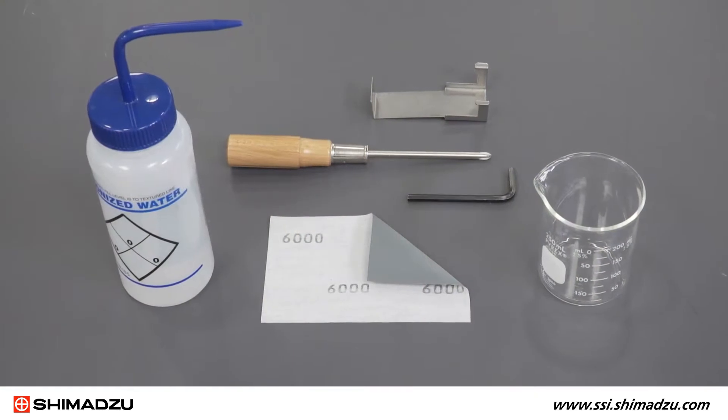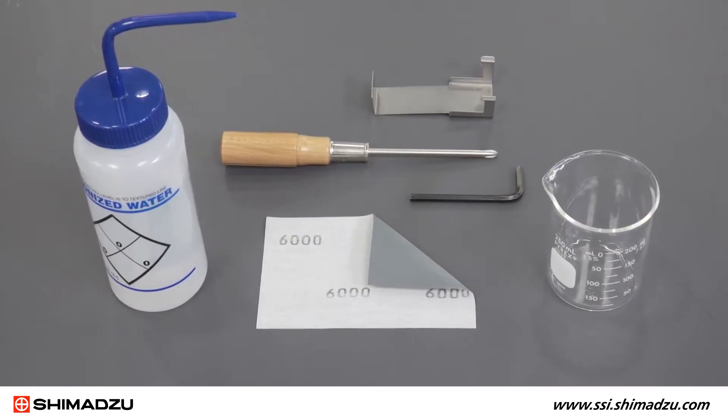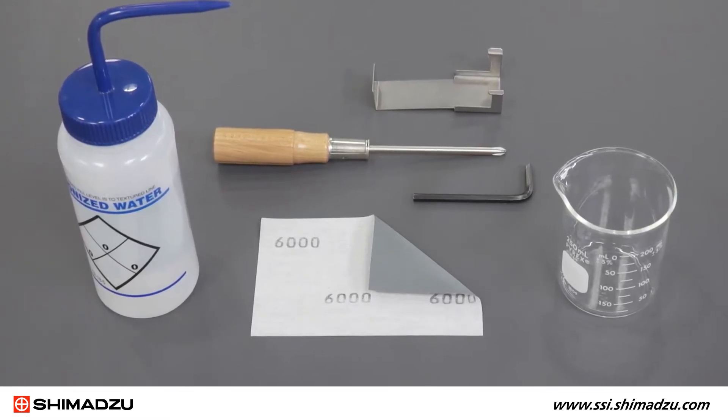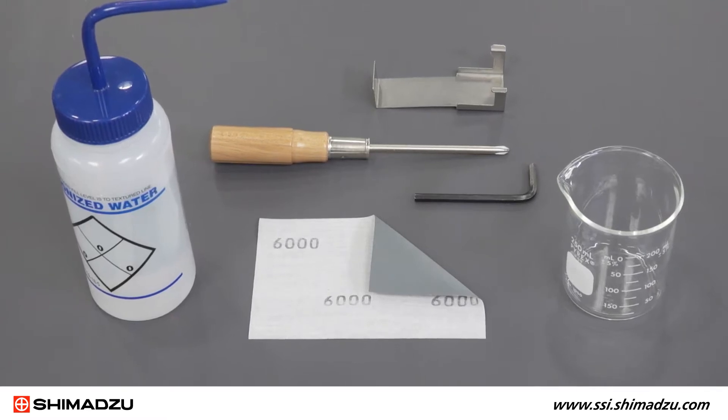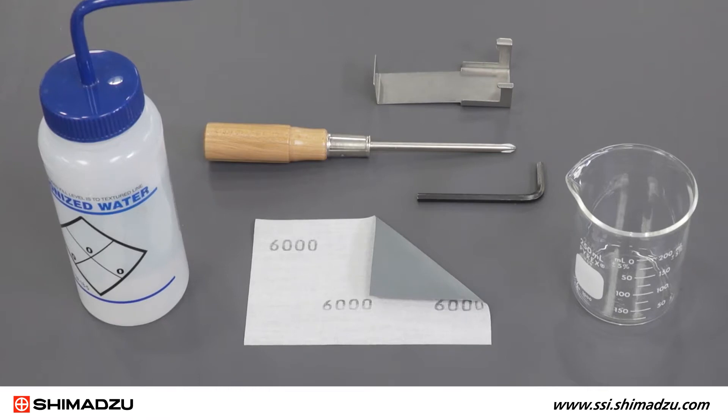You will need the following tools and supplies: water and/or an appropriate solvent, a drawing tool, a Phillips screwdriver, a 5 mm hex wrench, 6,000 grit abrasive cloth, and a beaker. Optional replacement parts include a new sampling cone.